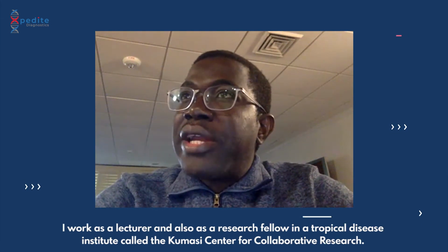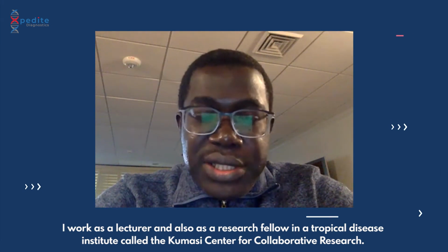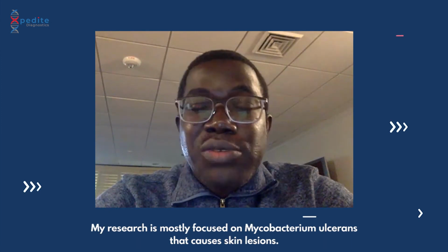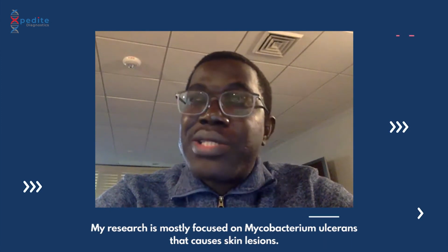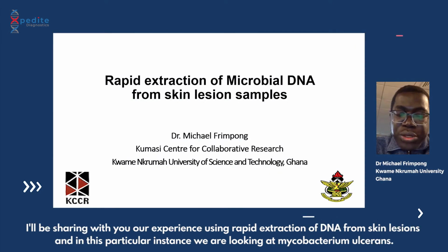So once again, my name is Michael Frimpong. I'm working at Kwame Nkrumah University of Science and Technology as a lecturer and also as a research fellow in a tropical disease institute called the Kumasi Centre for Collaborative Research. My research is mostly focused on Mycobacterium ulcerans that causes skin lesions. I'll be speaking with you on our experience with using rapid extraction for DNA from skin lesions.